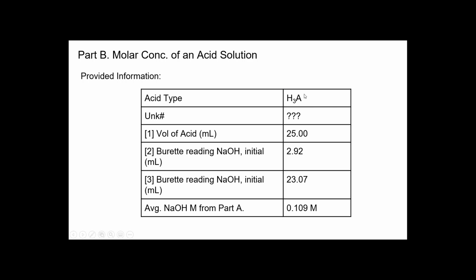So I was given a triprotic acid. I was given an unknown number, but you guys don't need to know that. My volume, this is what's in the flask on the bottom of the burette. And then my readings and my average molarity of my base.